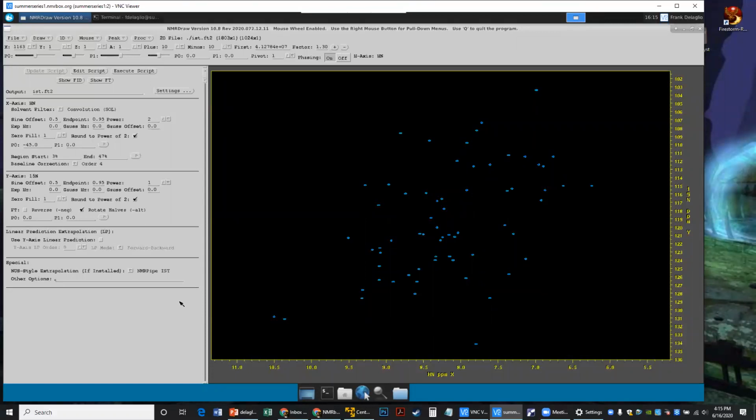For that reason, we developed this option of doing the IST reconstruction directly without having to go back to the original time domain data, which gives you a mixture of partially suppressed non-uniform sampling artifacts and a new set of artifacts from the final Fourier transform. All that said, for 90% of the data that you look at, it won't make any difference at all, and we will see examples of exactly that.